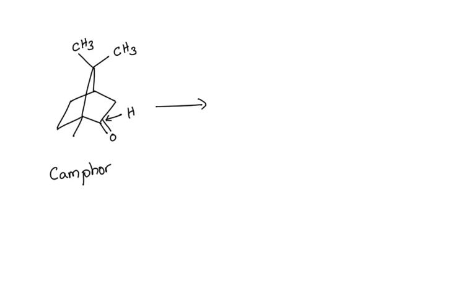The first hydrogen source is sodium borohydride, which has the hydrogen nucleophile. You might have used this in the alcohols chapter to synthesize alcohol through reduction reaction. This is exactly the same reaction that you studied in the alcohols and phenols chapter.